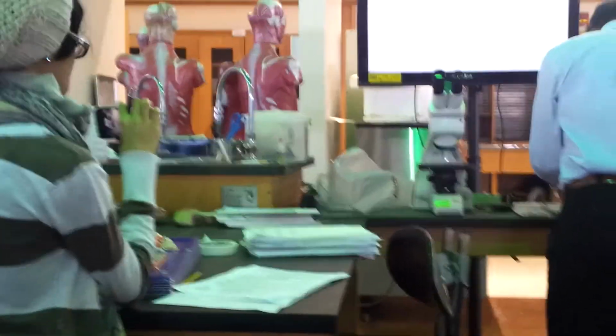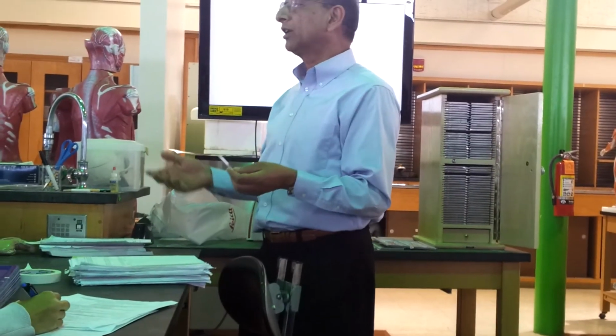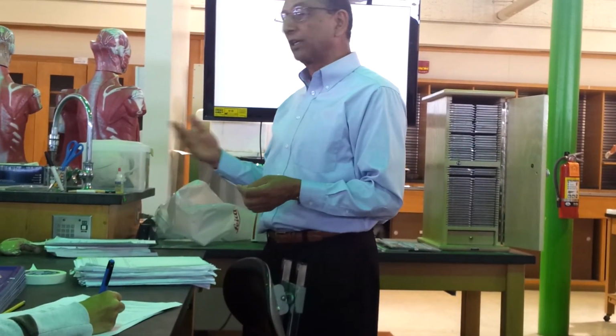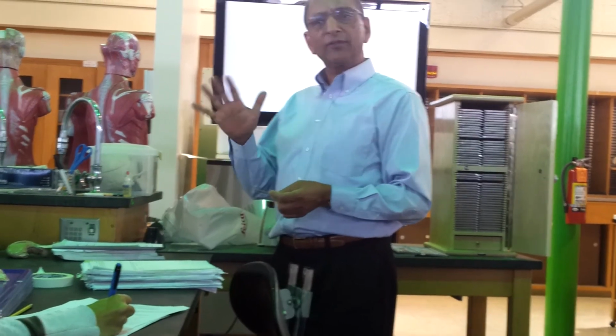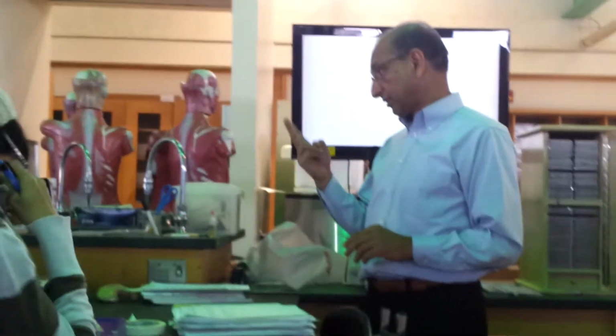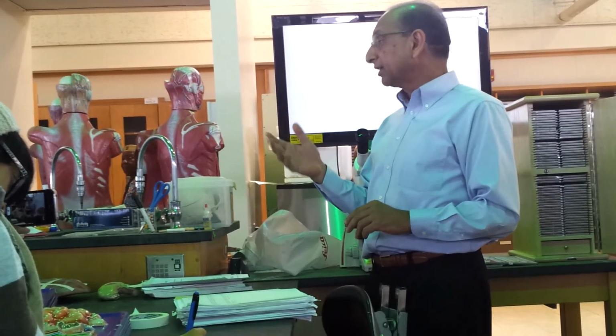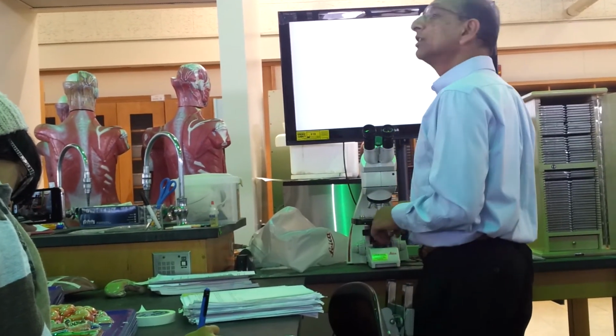Salivary gland, here in this slide you see sublingual. It must be sublingual, submandibular or parotid, whatever, right? So they give a different picture because different ones have different numbers of serous cells and mucous cells, two types of cells. And I told you mucous cells, goblet-like cells, they look empty, they look clear, light color. Serous cells look dark.